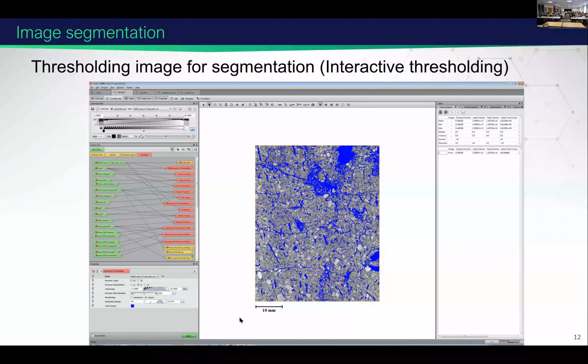While analyzing soil structures especially, the color map histogram is a continuous bell-shaped curve, which tells you that the various phases are overlapping each other. In such cases, sometimes we select the pores along with the root, sometimes we do not. With this intensity range, the total porosity or pore volume fraction is approximately 20%.